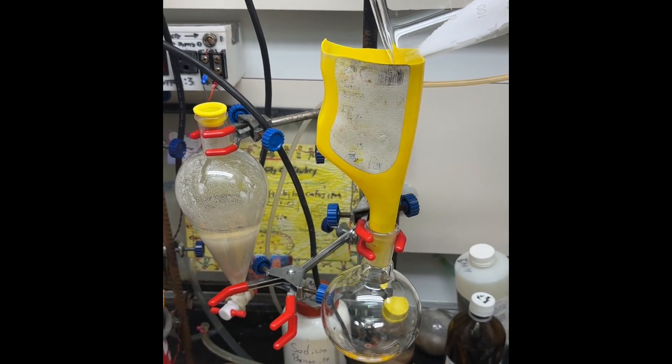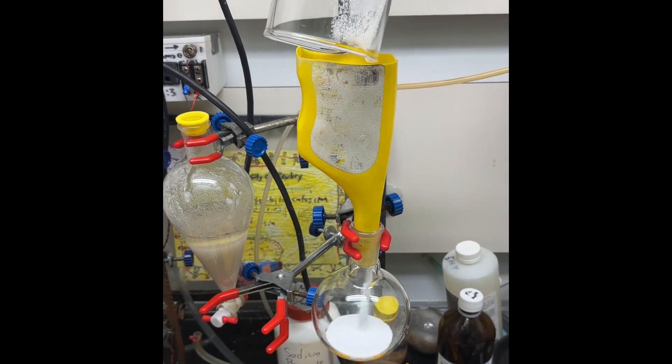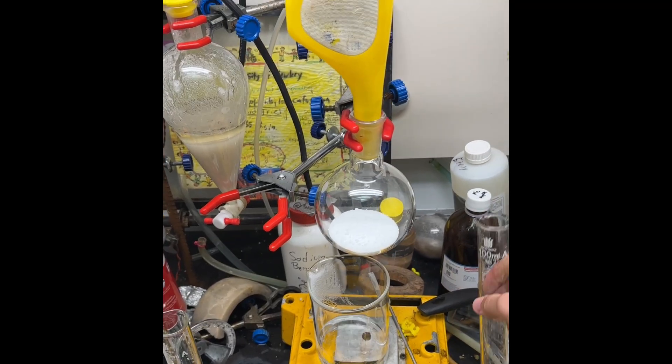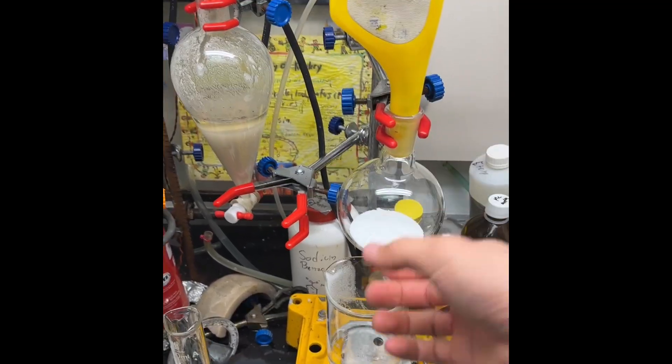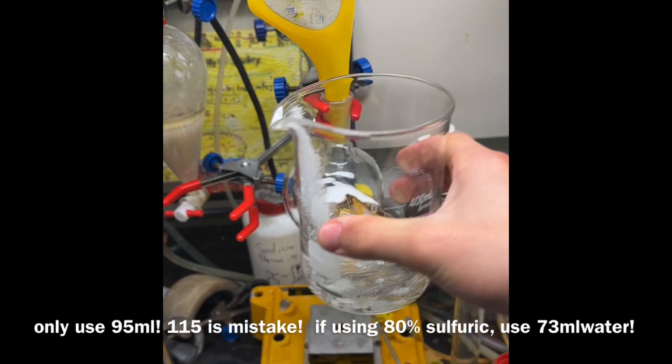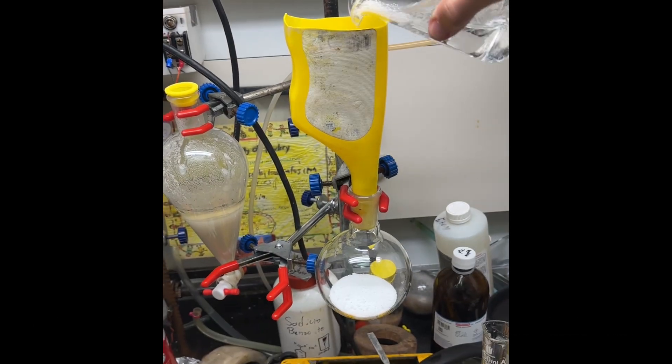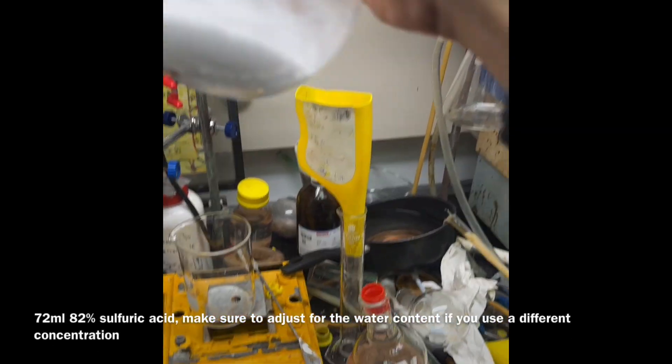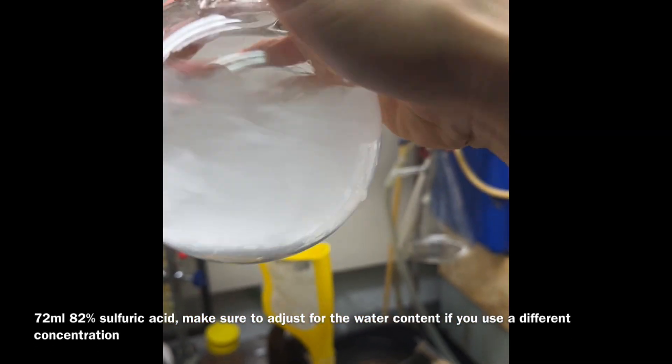Okay, so here's 111 grams of sodium bromide and about 95 plus 20 milliliters of water. The dissolution of sodium bromide is endothermic, it gets cold as it dissolves.